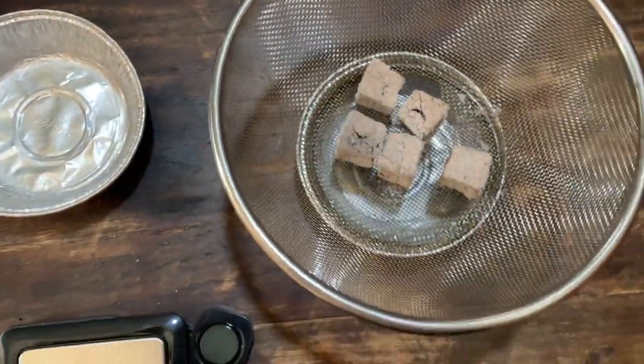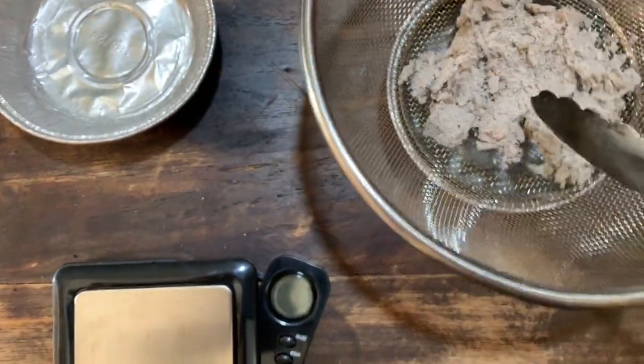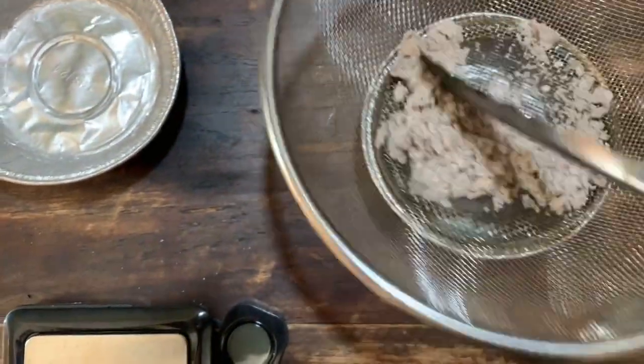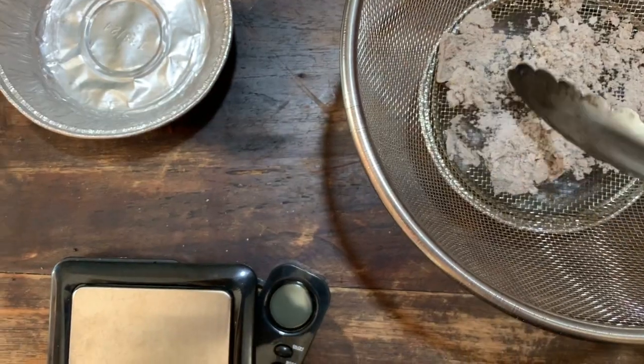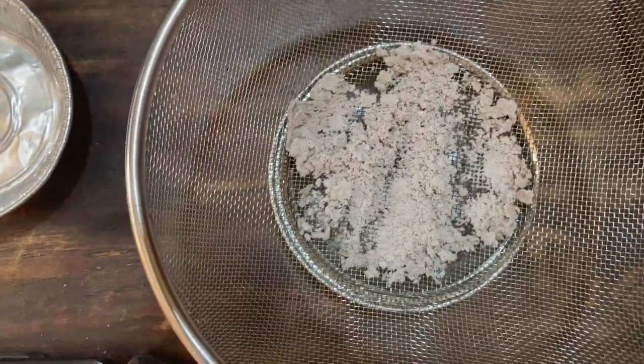Two and a half hours now and the briquettes have completely burnt down. We just want the ash to drop into the container underneath, then we'll measure the ash in the container.